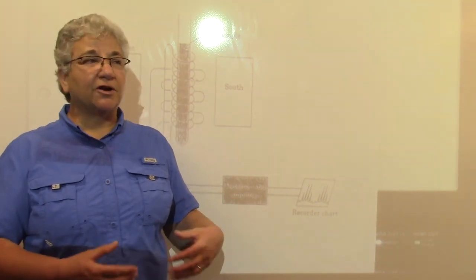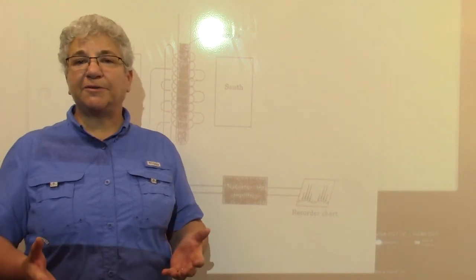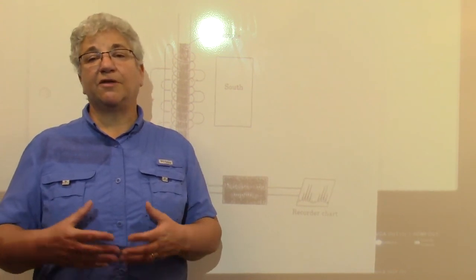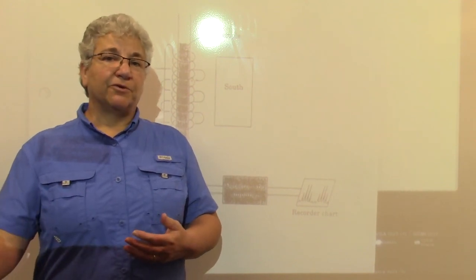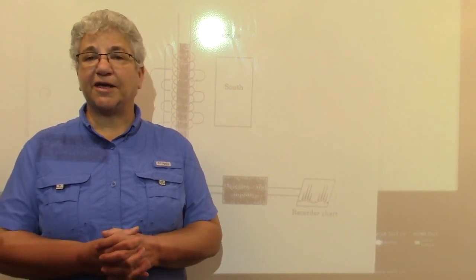And so what we're going to look at in NMR, there are really two types of NMR spectra that we tend to look at. One of them is carbon spectra, one of them is proton or hydrogen spectra. We will save hydrogen spectroscopy for the spring semester and just worry about carbon spectroscopy right now.